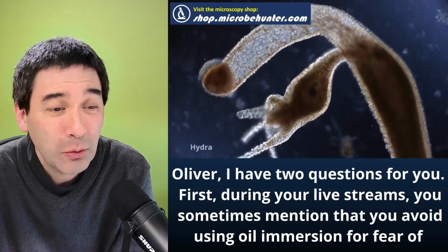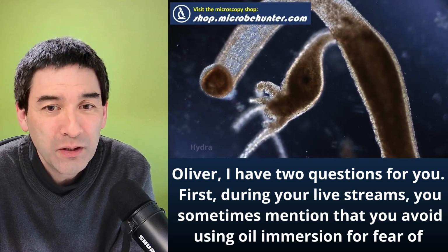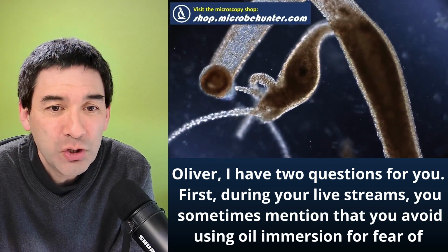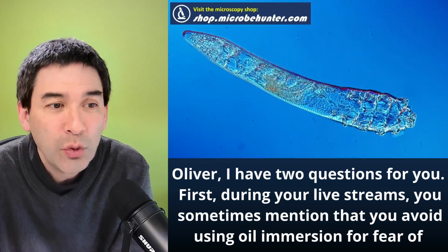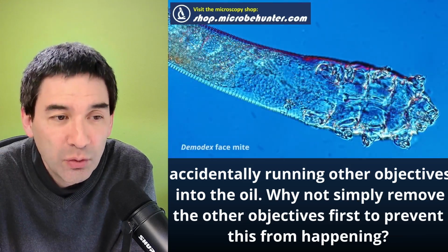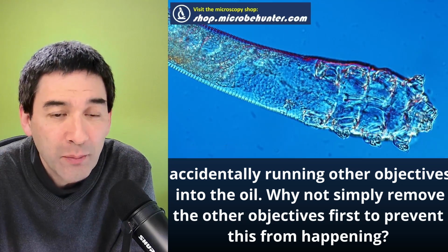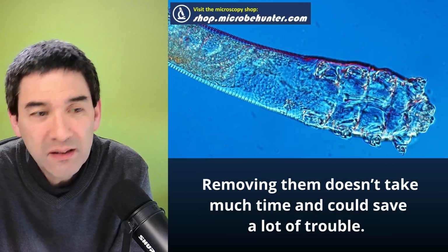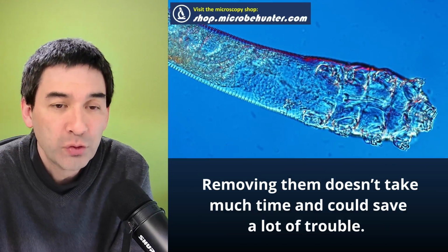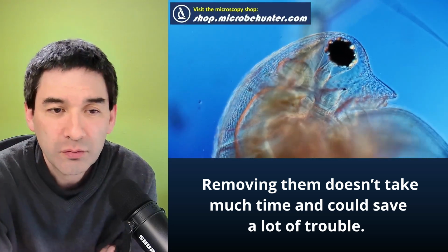The question is a little bit longer here. Actually, there's two parts here. I have two questions for you. First, during your live streams, you sometimes mention that you avoid using oil immersion for fear of accidentally running other objectives into the oil. Why not simply remove the other objectives first to prevent this from happening? Removing them doesn't take much time and could save a lot of trouble. Yeah, and then there's also a second question which I'm going to read later.